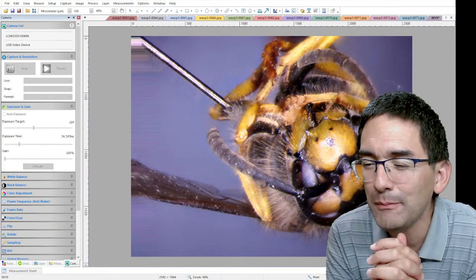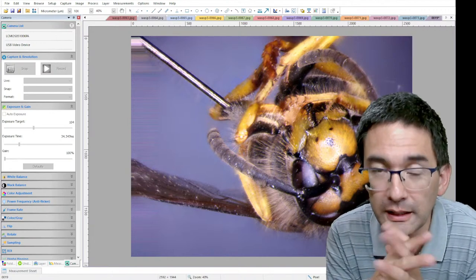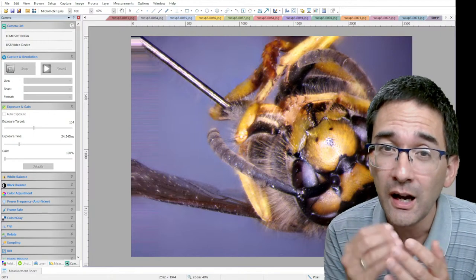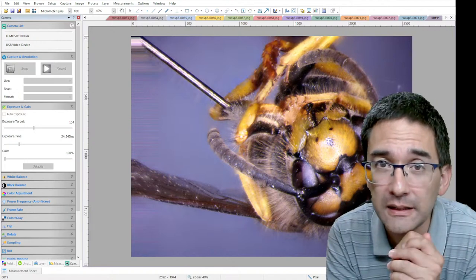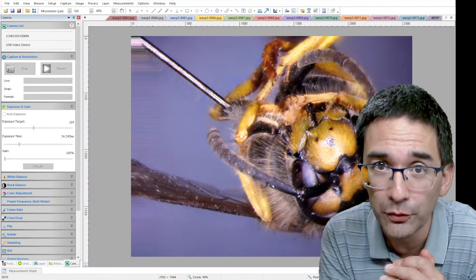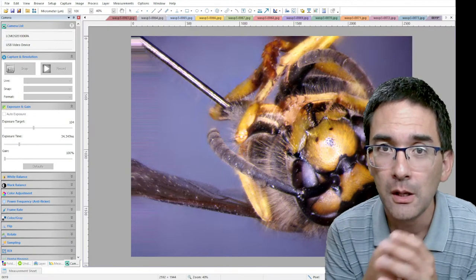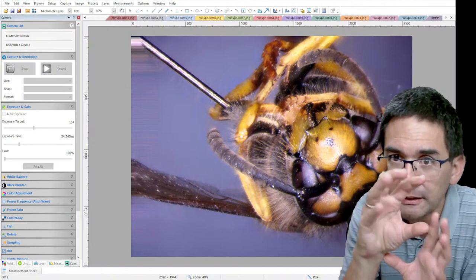That's some sophisticated image processing software. As a matter of fact, if you use dedicated software like Helicon Focus, and there are some others, it allows you to fine-tune even more things. However, concerning the stitching part, I will be honest with you, I've had problems finding other panorama software. Most commercially available panorama software assumes that your camera is standing on a tripod and that you're rotating the camera.